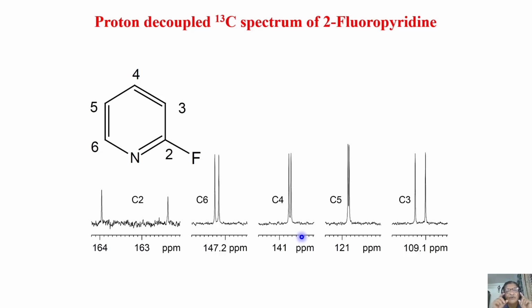That is 1 carbon for 1 peak for each carbon. At the same time, I must assign whether it is a CH3 carbon, a CH carbon, a CH2 carbon, or a quaternary carbon, based on the number of protons attached to the carbon. Can I do the editing? This is possible. This is a common experiment which most of the time chemists make use of for identification of carbons based on the protons attached to them. Individual carbons can be assigned.